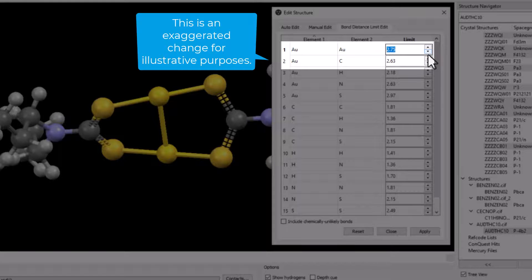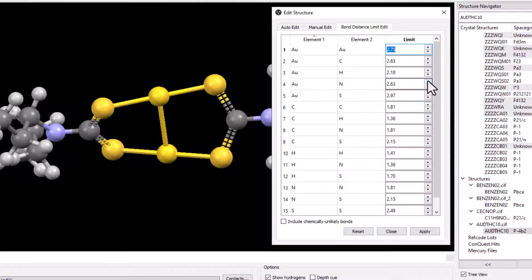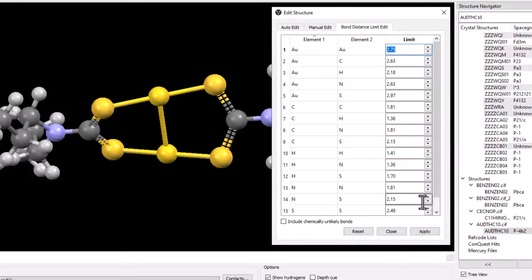The bond distance limit is now significantly smaller. Click apply.